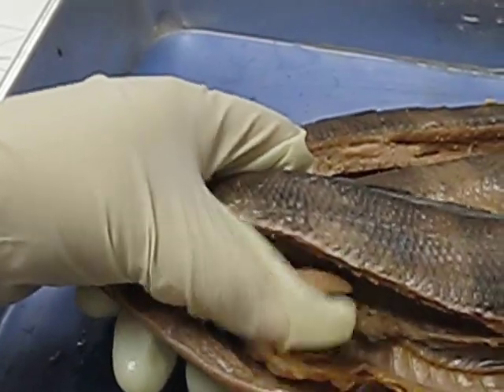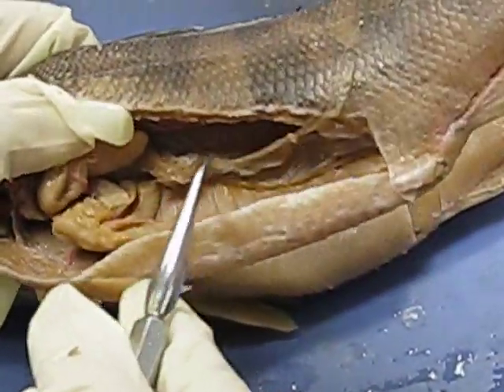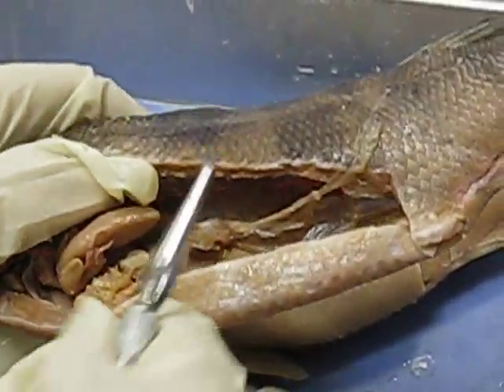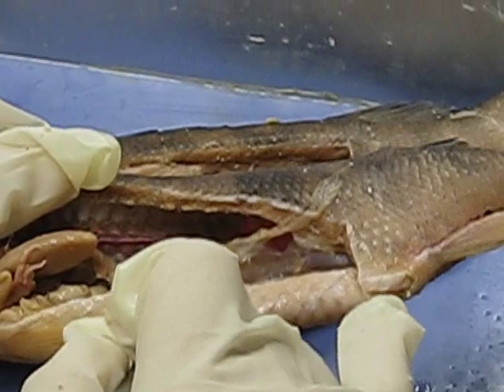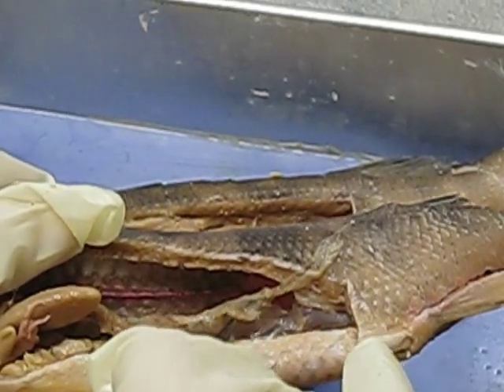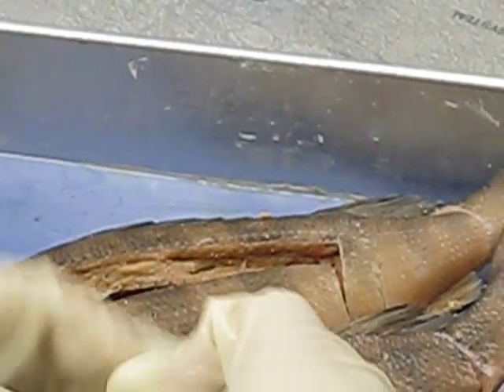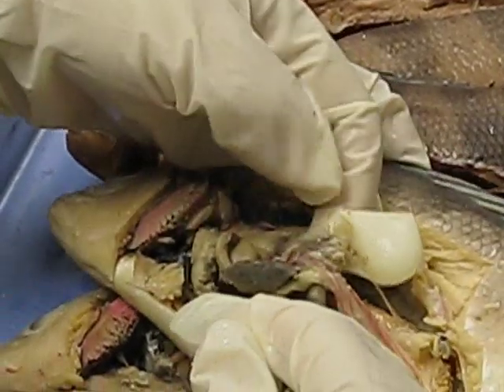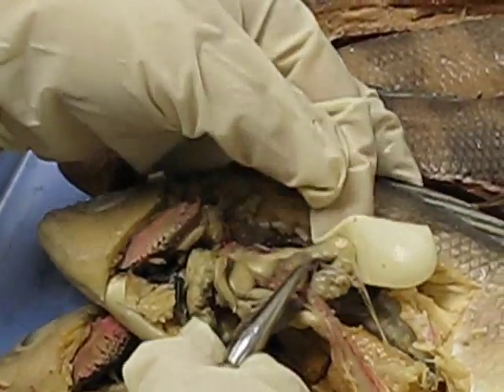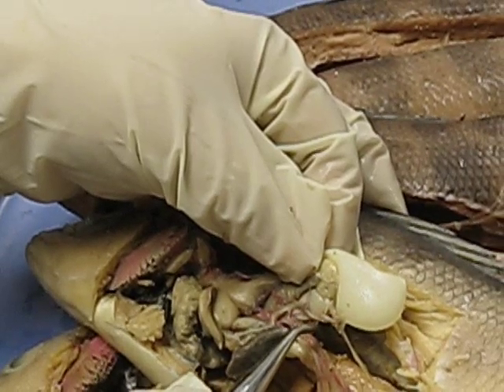Then you trace it all the way back. Of course this is your intestine right here. Right here is part of your swim bladder. You got the membrane that you guys broke. So the first fold of the intestine right here — just the first fold — is your duodenum.